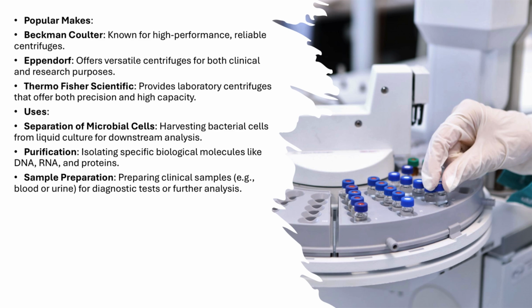Purification. Centrifuges are also essential for purifying biological molecules like DNA, RNA, and proteins. By spinning samples at high speeds, scientists can isolate specific molecules of interest, which is crucial for genetic studies, diagnostics, and research. Sample preparation. In clinical labs, centrifuges are used for sample preparation.